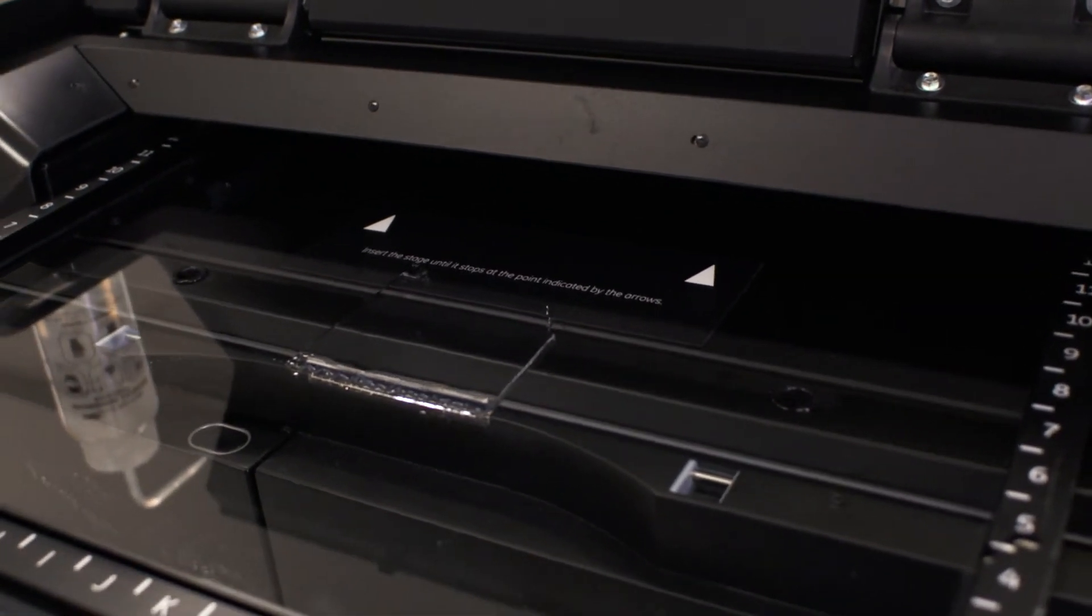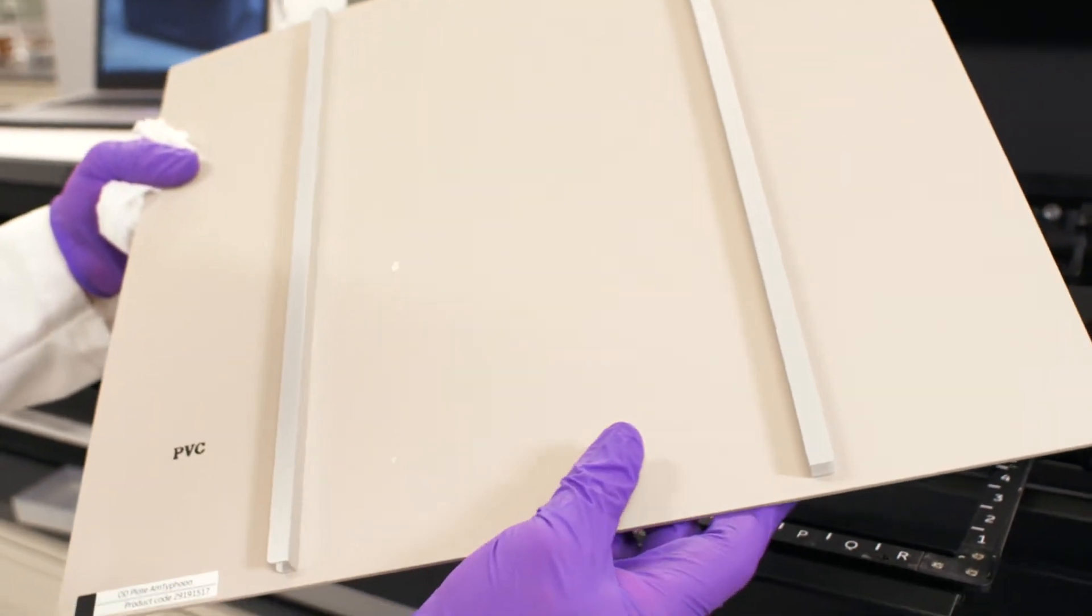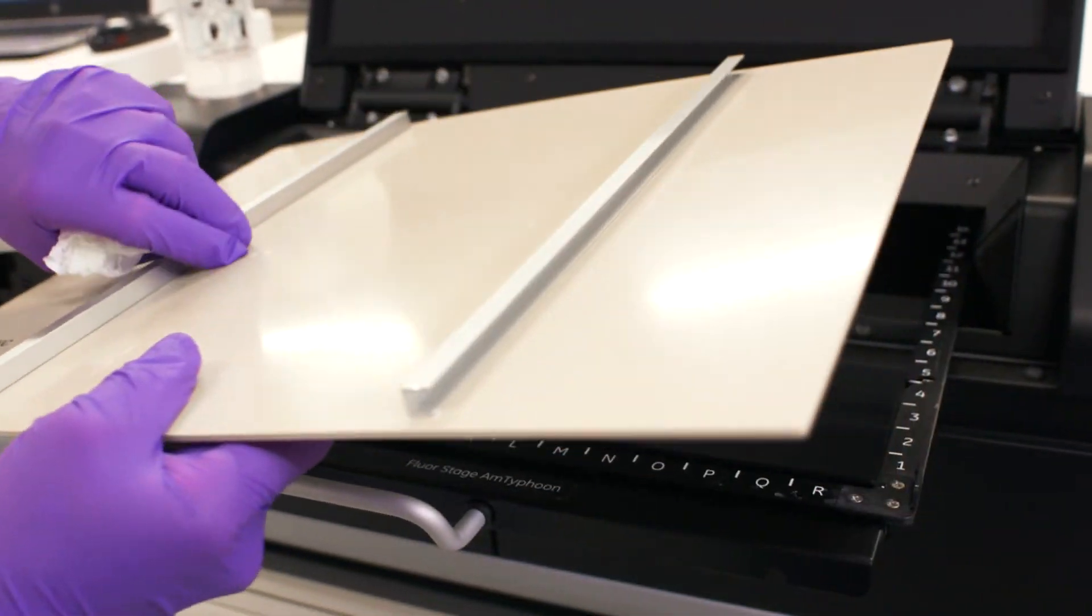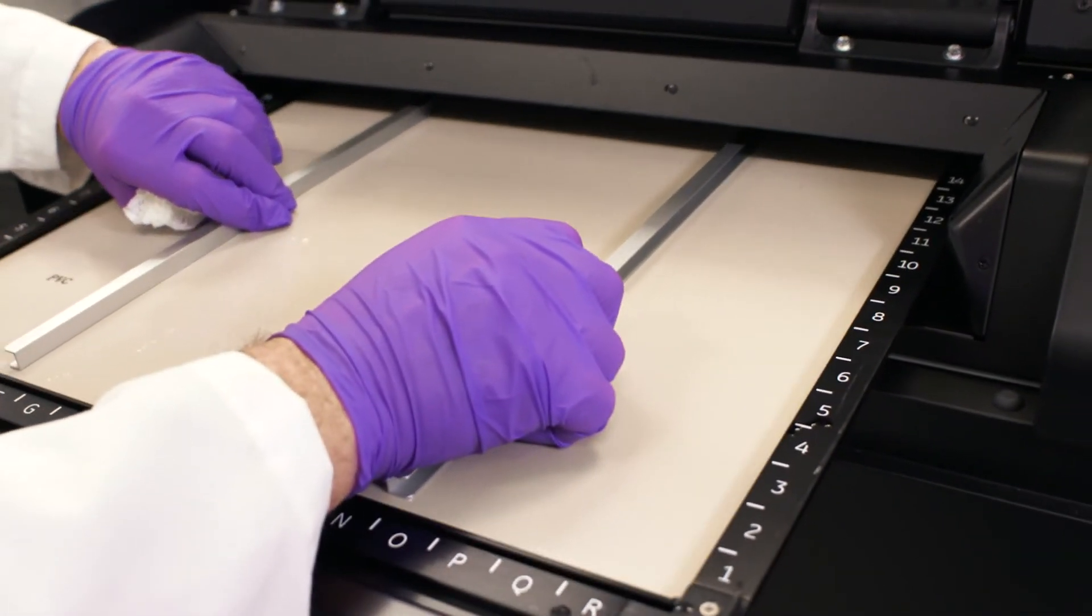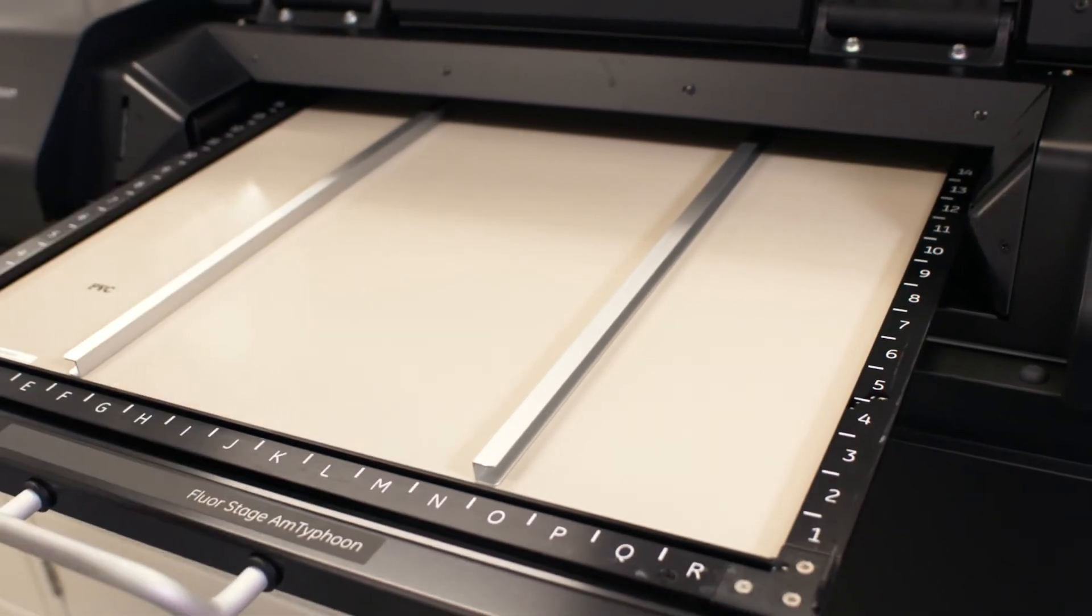We then need to use this beige board, which you'll see is called the OD plate. It has two handles which we're going to use to place this on top of our sample. This could be a Coomassie or a silver stain gel. That's just going to sit in place like so.